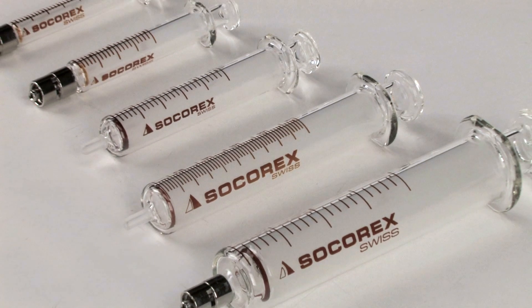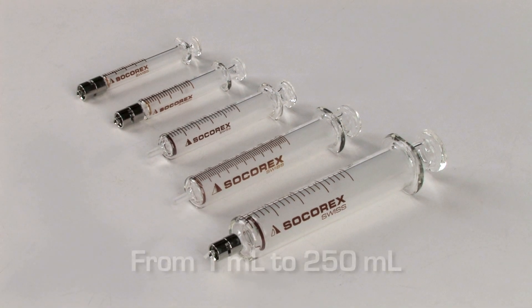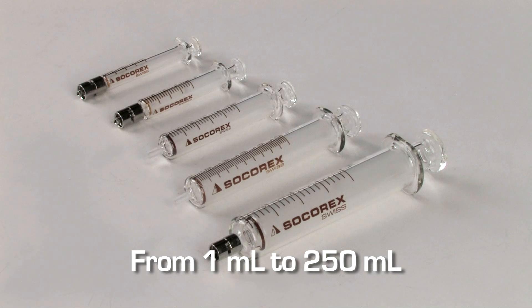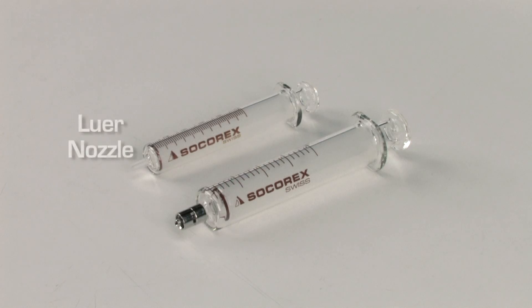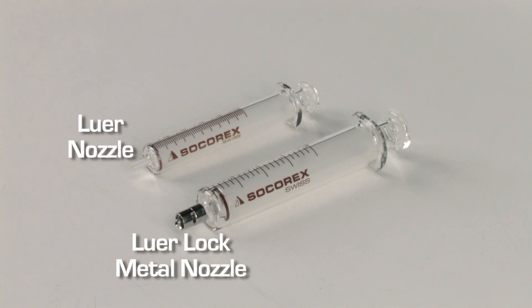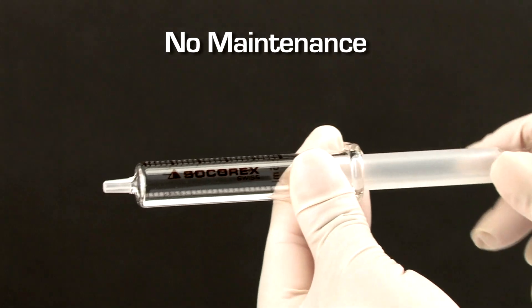A complete range of all-glass syringes complements the Dosys family for many applications. The all-glass syringes are available in various sizes, up to 250 milliliters. There are two nozzle types: a Luer nozzle and a Luer lock nozzle. Instant disassembling for cleaning with no maintenance required.